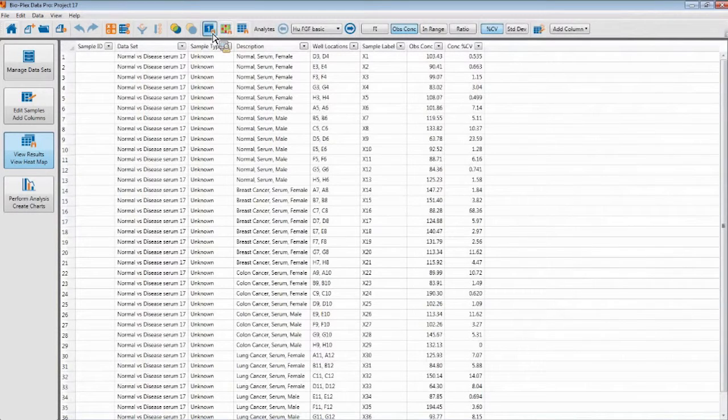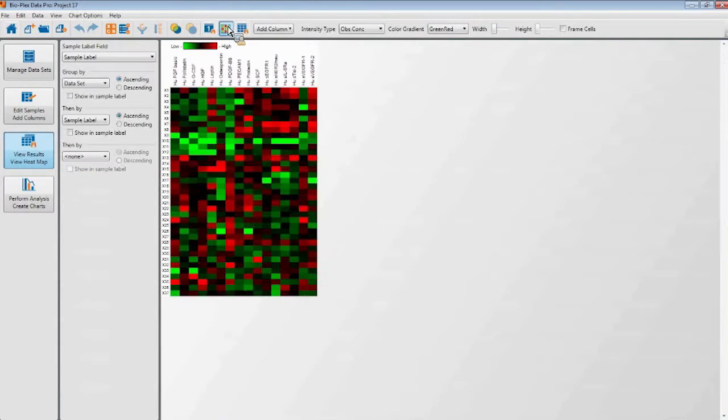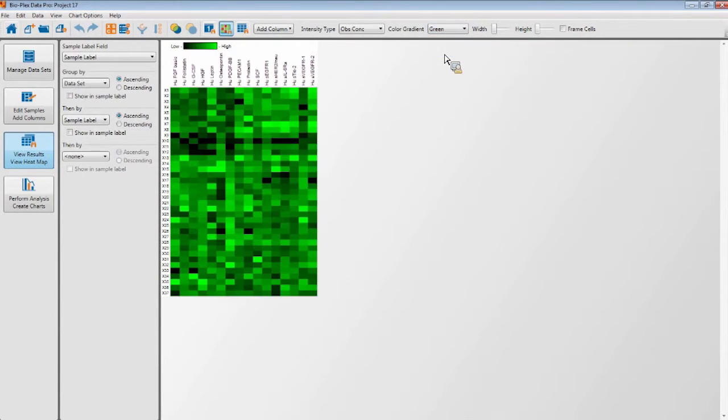In the single and multi-analyte layouts, you can use the buttons above the table to select additional parameters to view, such as the standard deviation values. On the heat map, you can select the parameters being mapped, how they are displayed, and what color palette is used on the heat map.